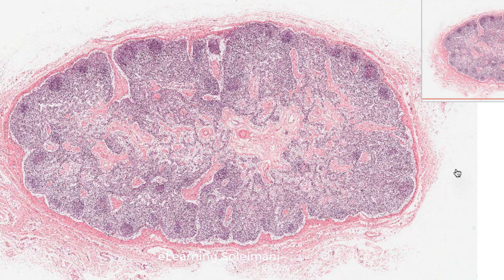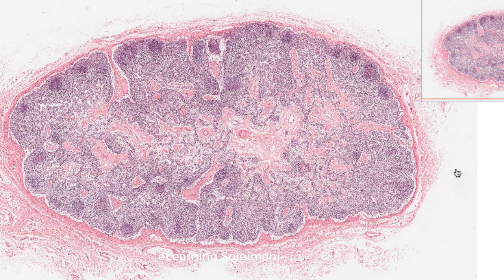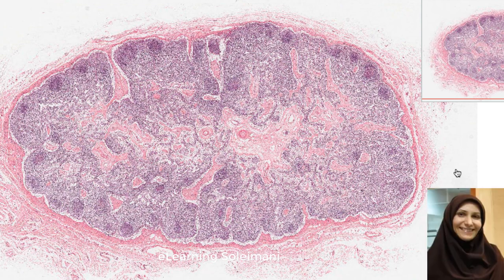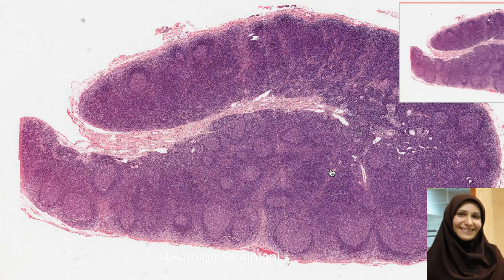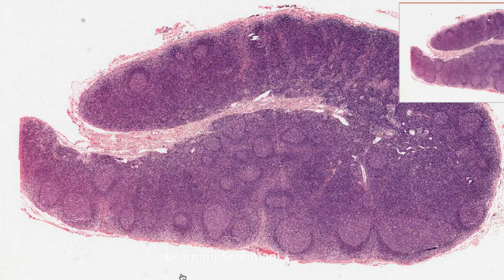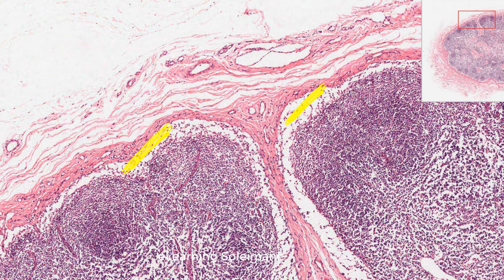Look at the lymph node, which is a bean-shaped structure that has a hilum. This hilum is visible at some sections and not visible at some sections. The lymph node is covered by a capsule of connective tissue. The space beneath the capsule is called the subcapsular sinus.